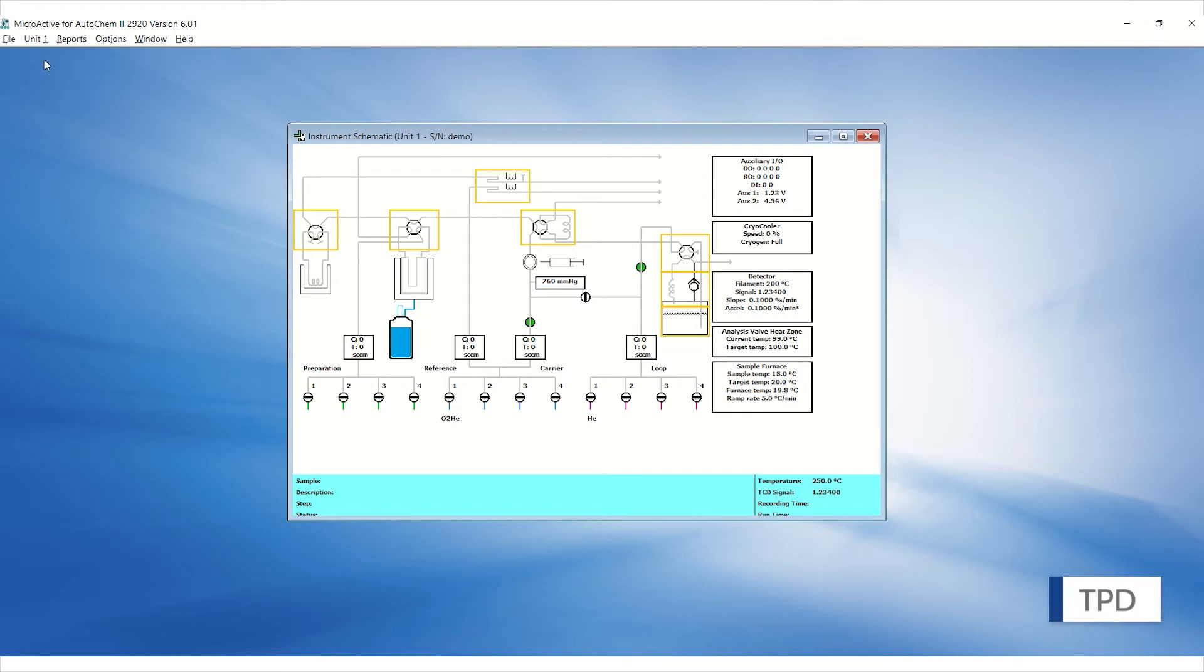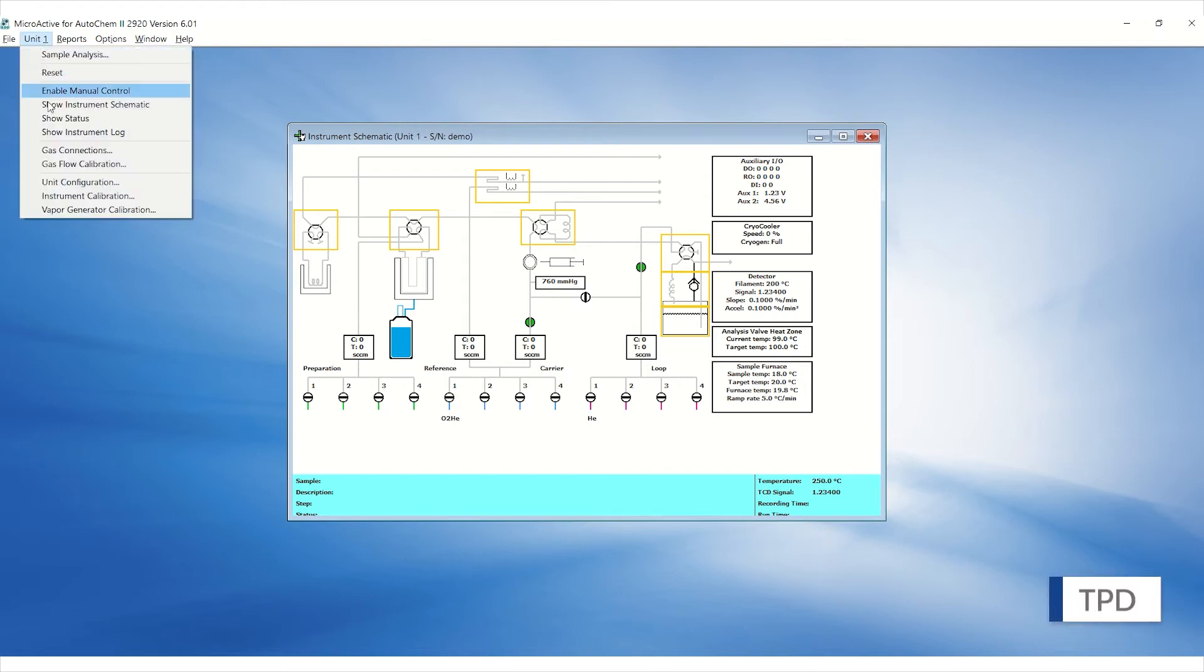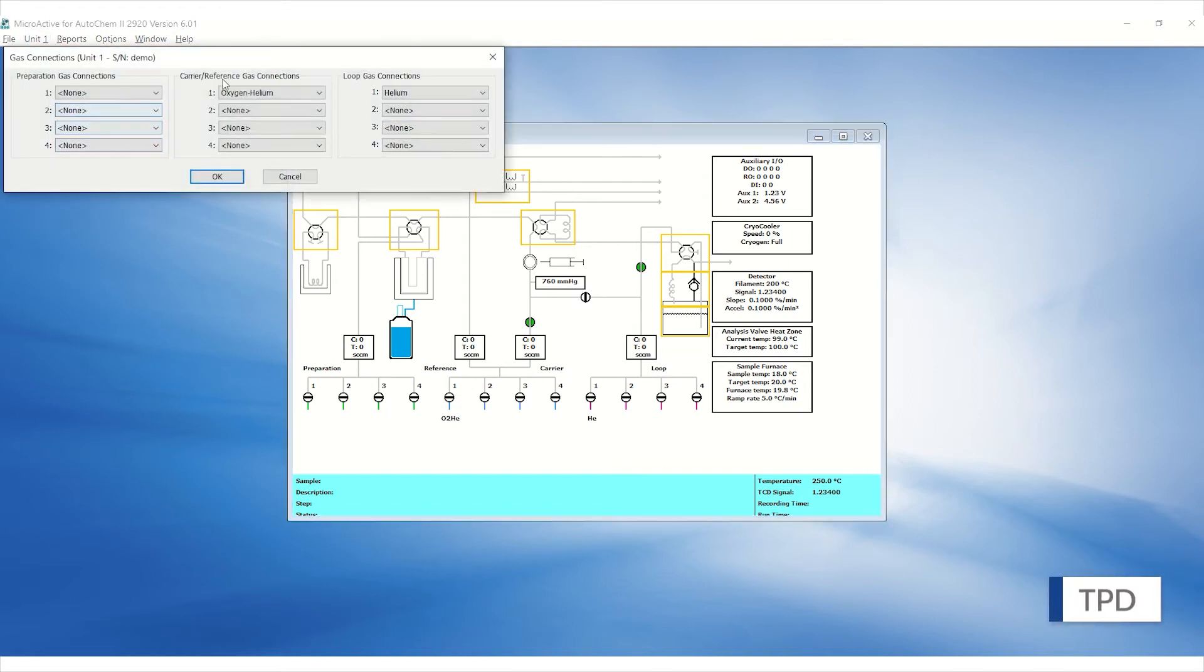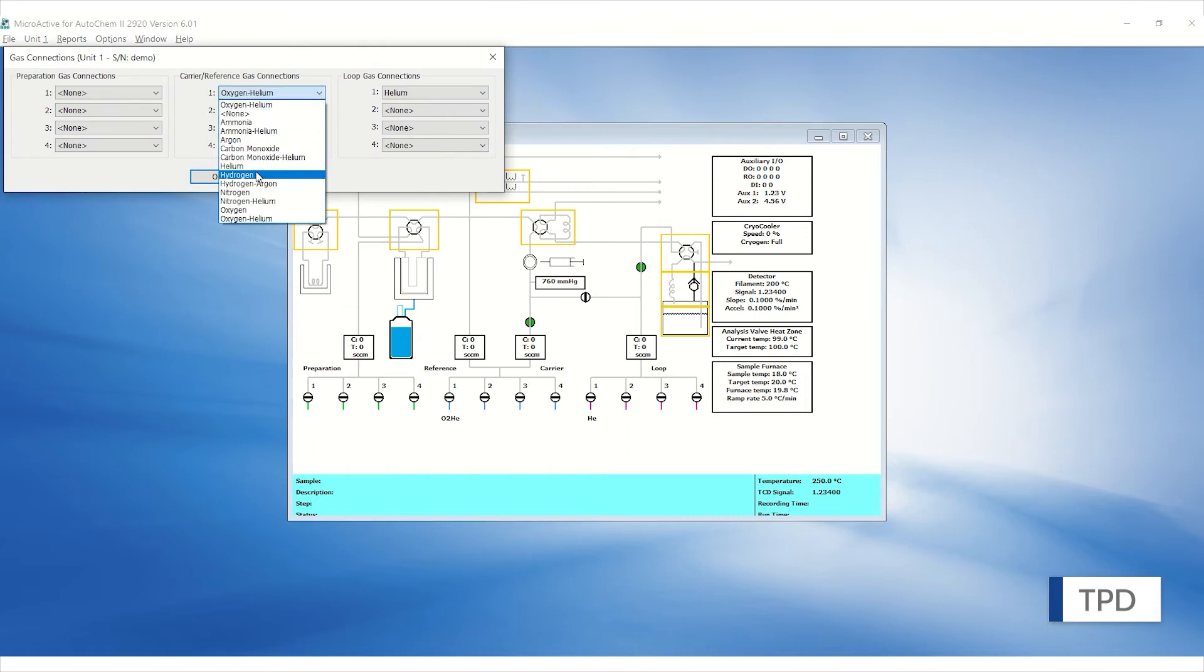TPD has a different setup with the inert gas, usually helium connected to the carrier and ammonia blended in helium connected to the loop.